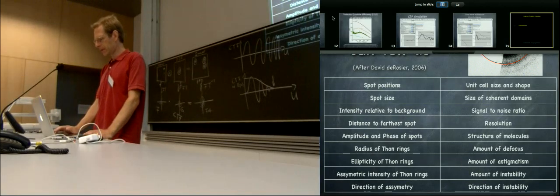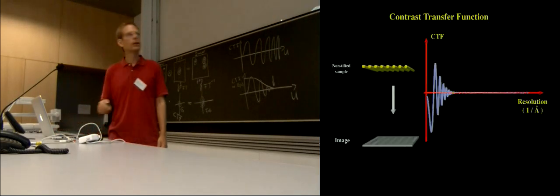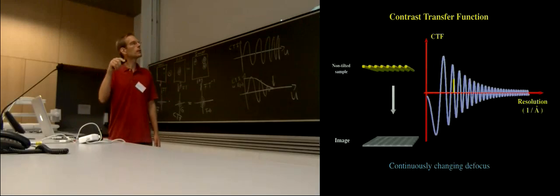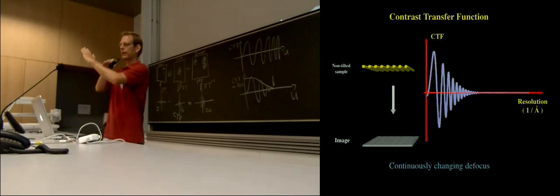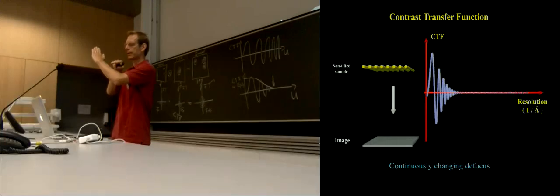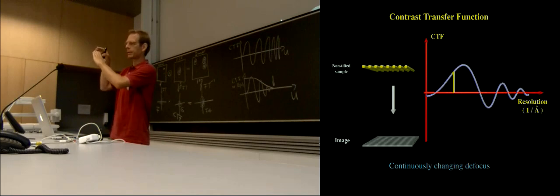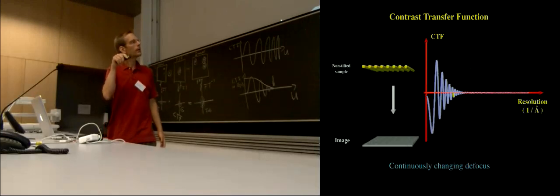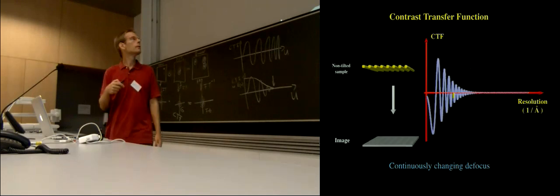this famous animation. When you defocus a lot, you're not only changing the shape of the CTF, but also of the envelope function. And when you defocus a lot, then your resolution goes down. So if you have a tilted sample, then this is, for example, the ideal defocus, and here your CTF looks perfect. Here it's too much overfocus, and here you are in focus, or too much underfocus. And then here you have bad resolution in addition, because you have a strongly defocused microscope like now, and the resolution of the machine is actually in that area of the micrograph quite bad. So that's another advantage.